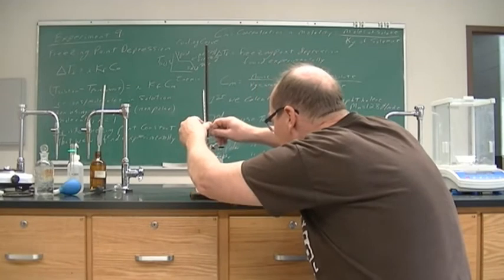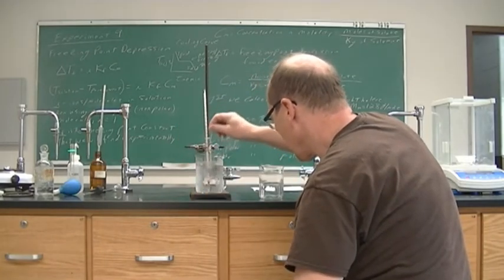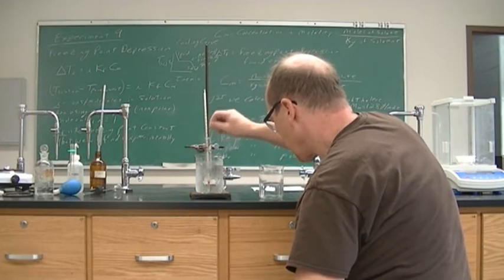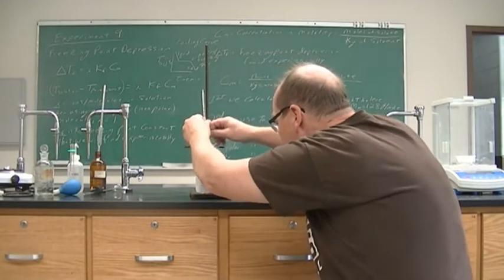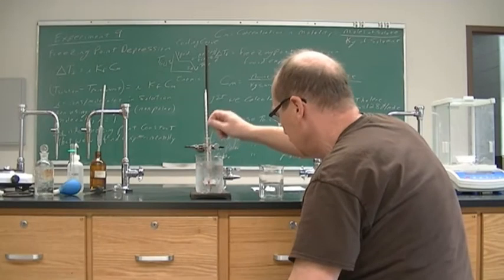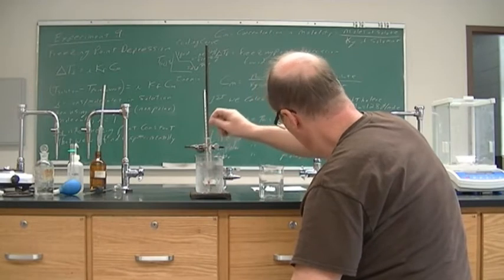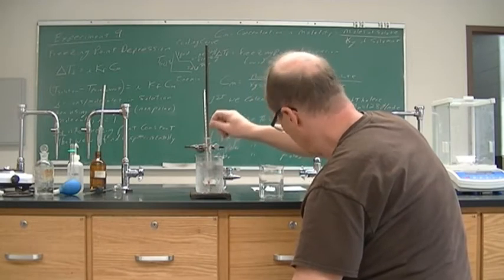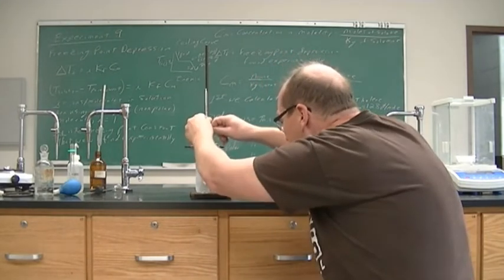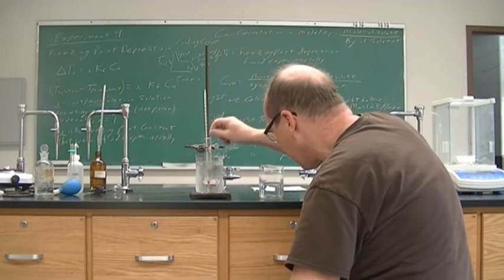Now it's at 5. And now it's at 4. Still at 4, but I don't see any solid forming.